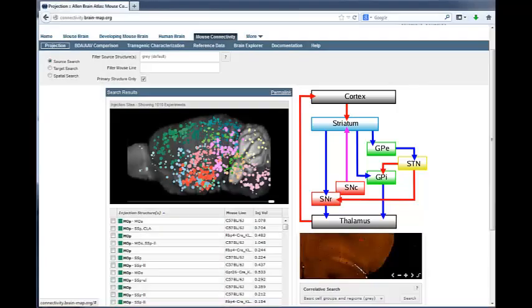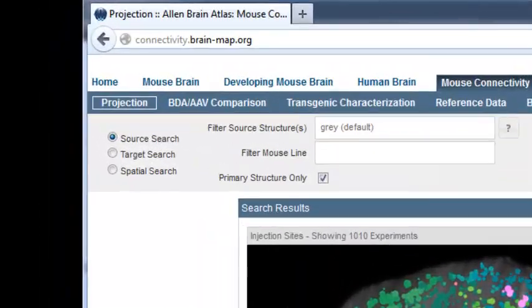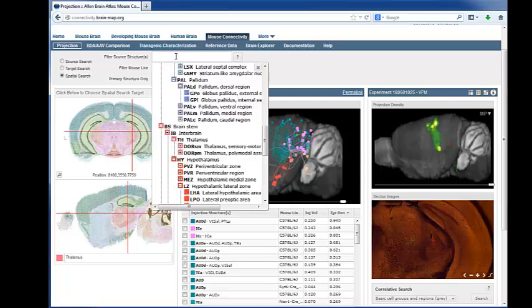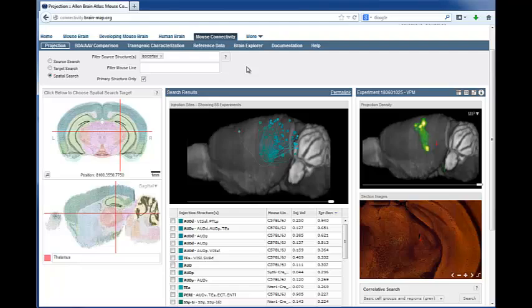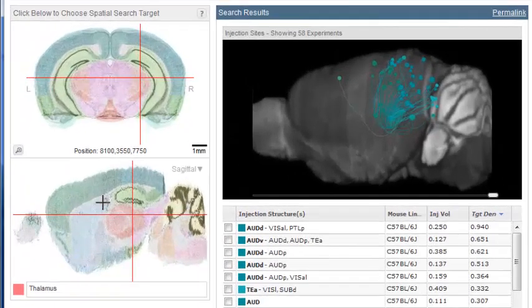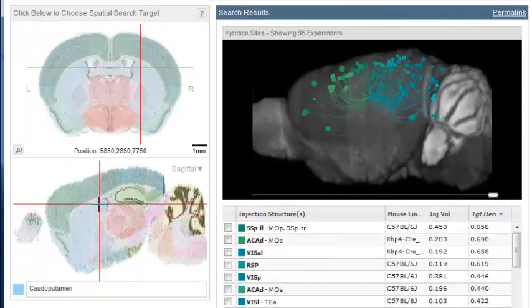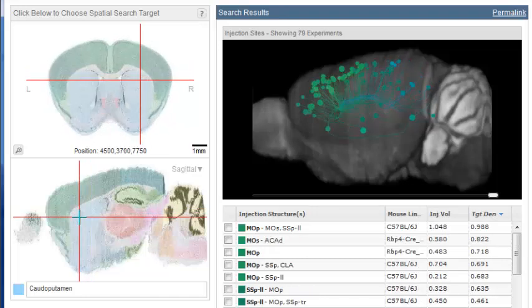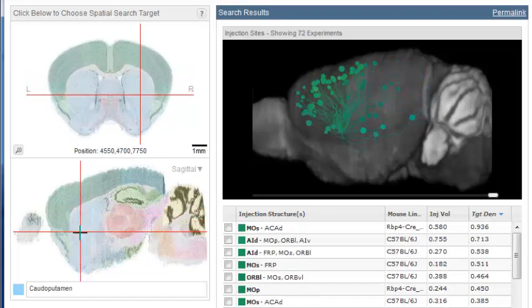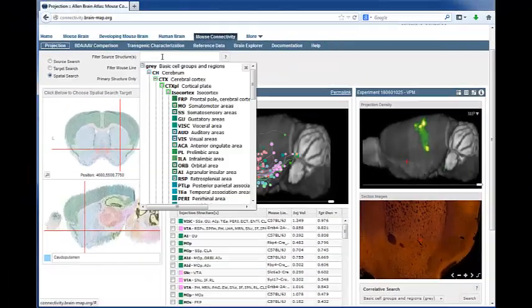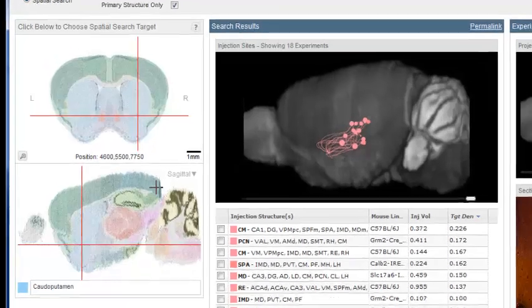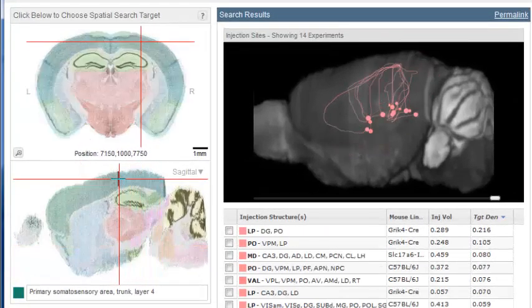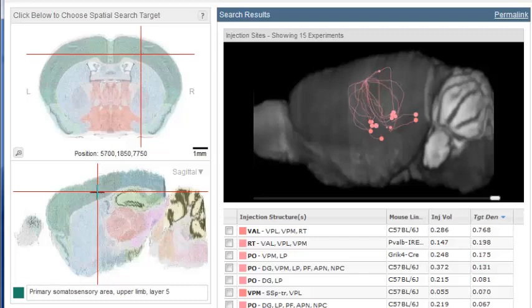One way to view the connections from the cortex to the striatum, or the connections from the thalamus to the cortex, is to use the spatial search feature. The spatial search feature is a virtual retrograde search at the voxel level. If we select all injections in the cortex, we can see which regions project to the striatum by selecting a voxel in the striatum. This particular view allows you to see the topography of the corticostriatal projections or the thalamocortical projections.